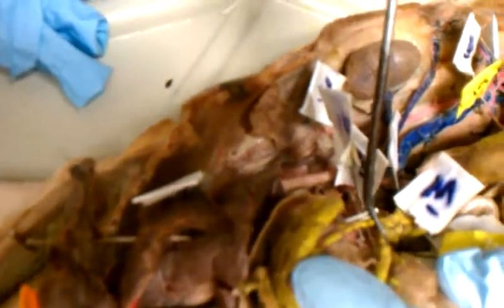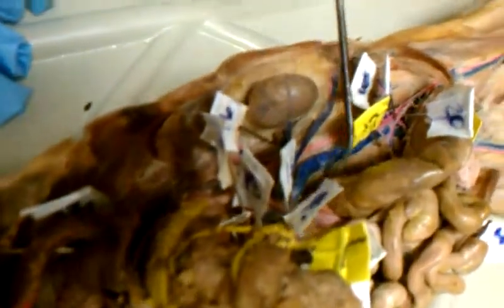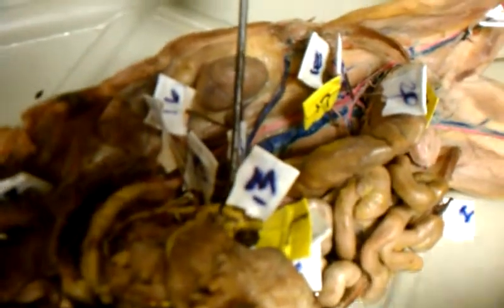And then the third branch is the splenic artery that's connected to the spleen. And then this is the splenic vein, right? Or do we even need to know that? I don't think so. Yellow. Yeah. Splenic vein. And what's this one? Is this the gastro? It's real small. It's gastrosplenic.